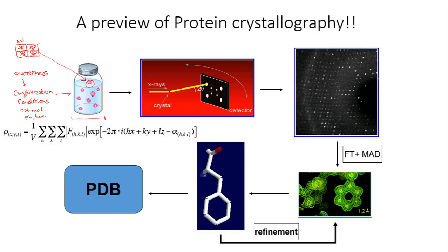The crystals that you obtain in protein crystallography are very microscopic, and you would need some microscopic techniques even to mount it on the X-ray crystallography machine. So these are very small, though as it seems that these are present in jars, they might appear bigger. This is just a representation. So don't get any false ideas that this would be very big.